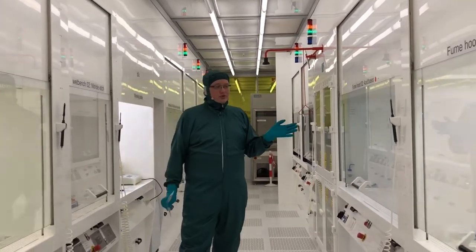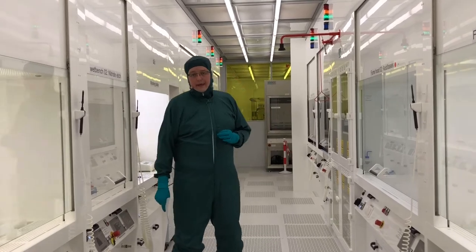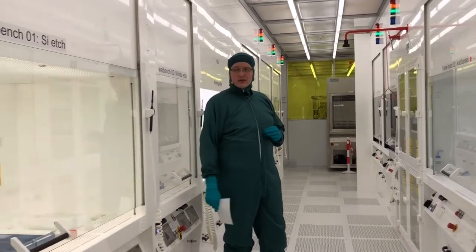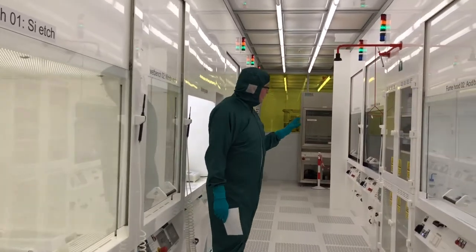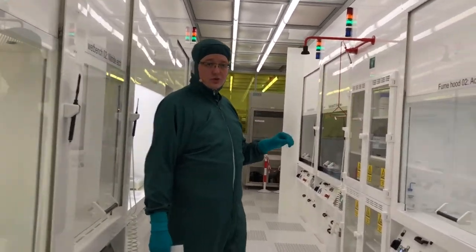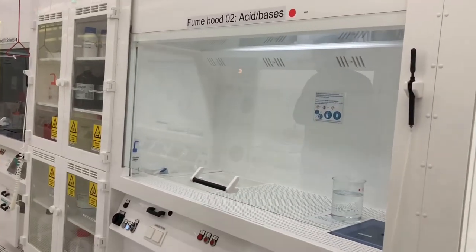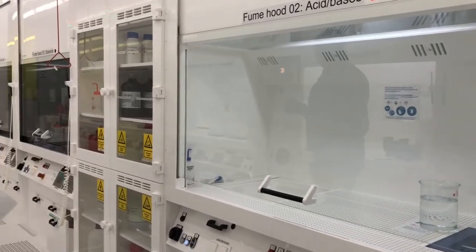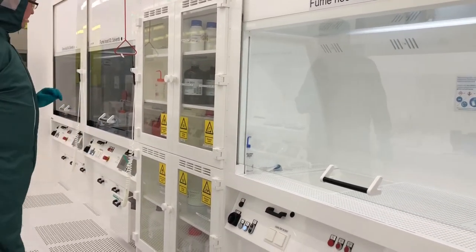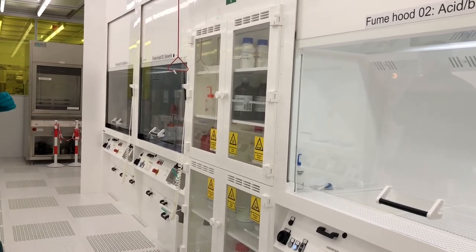Although fume hoods and wet benches look very similar, they work very differently and we will take a look at the wet benches later. In this room we have eight fume hoods in total — four on this side and four on the opposite side. We have two different types of fume hoods: one for working with acids and bases, and another type for working with solvents. We will take a closer look at both of them.